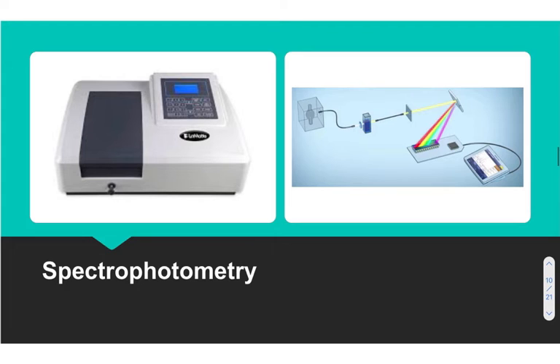Another really important lab technique in biology is called spectrophotometry. And this one, if you have done a biology class with a lab component or even a chemistry class with a lab component, you've probably done it. The way it works is that we put our sample in a little vial called a cuvette that's got clear edges, and we shine a light through it, and the machine lets us pick what kind of light that we shine. And that light of a specific wavelength is going to travel through our sample, and whenever there's a solute in there that can absorb that light of that wavelength, that light is going to kind of get lost. Now there's a detector on the other end of the cuvette that's going to tell us how much light did we get back at the end.